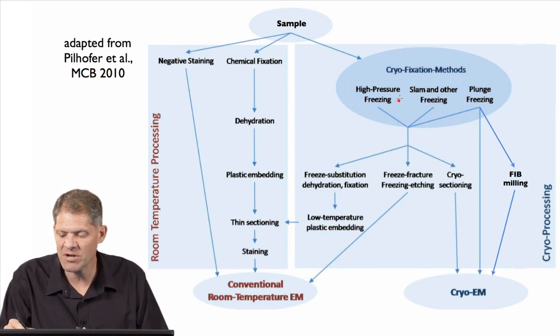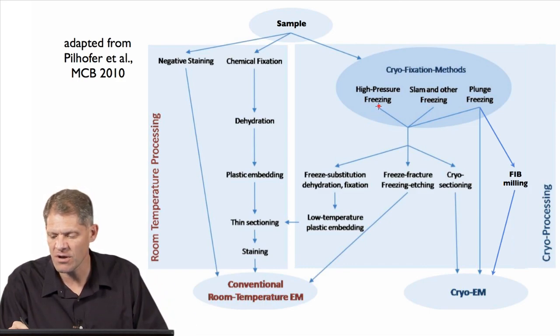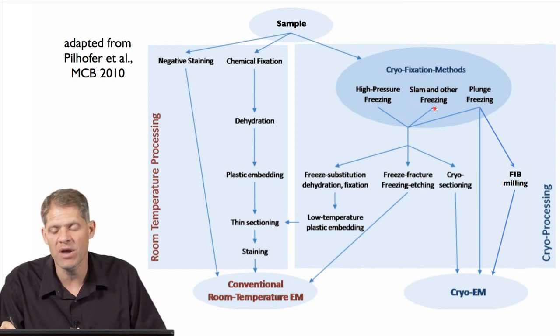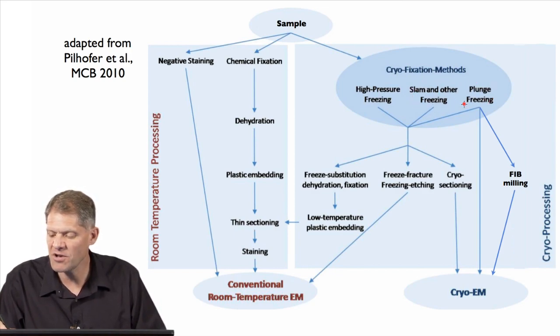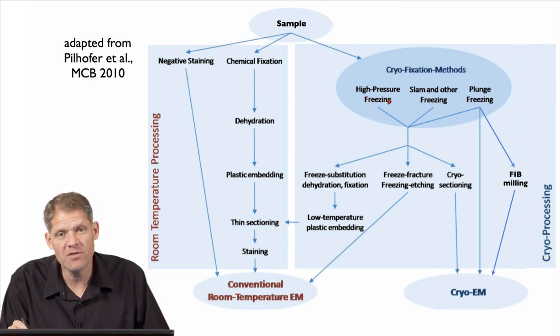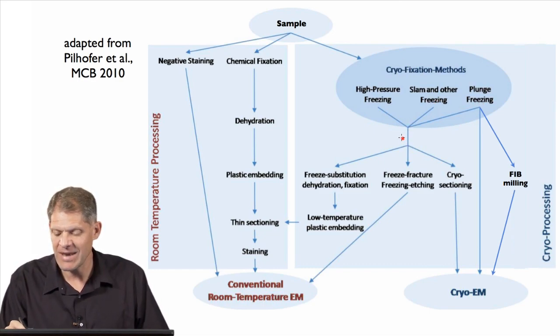We talked about high pressure freezing, where pressure is applied to prevent ice crystallization. There's also slam and other freezing techniques, which I didn't bring up. And finally, there's plunge freezing, which we did describe. Samples that have been high pressure frozen, slam frozen, or plunge frozen, again, there's a variety of next steps that can be taken.